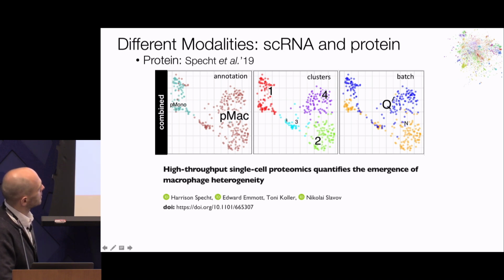These are unbiased clusters determined, but you see strong batch separation. For instance, there are 2 batches in here, and obviously that's picked up. That third population is a bit interesting, and we'll see it pop up again.